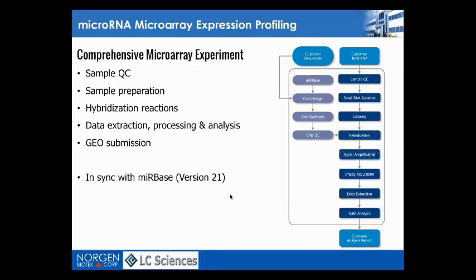For example, typically if you want to do overall profiling, microarrays are still a very good method, and another option for the overall profiling is next-gen sequencing. On the other hand, if you're looking really just at a subset of microRNAs or just very individual ones, then probably qPCR is the more cost-effective method to choose. So this, just as a recommendation, has a very nice flowchart and is a really good paper. It's from May 2012 in Nature Reviews Genetics.